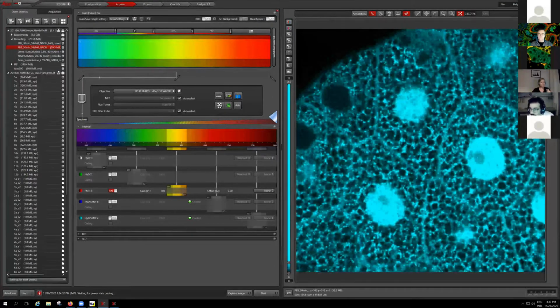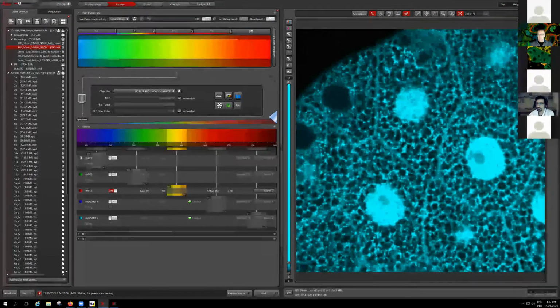And yes, Connie, go ahead. I just wanted to comment on the in vivo, in vitro situation. There are initial publications on in vivo situations. The lab of Svetlana Kalinina investigated tumors in living mice. So they have a way to assess the tumor, which is just underneath the skin as far as I remember. So it's somehow accessible, and it is an in vivo situation.